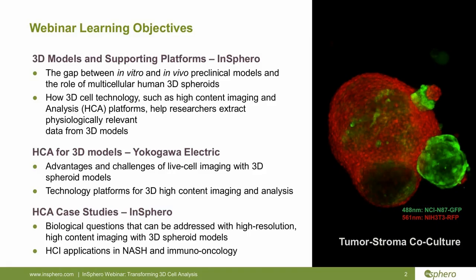So the objectives for today's webinar will include a brief review of how multicellular 3D models can help bridge the translational gap between preclinical and clinical drug development. We'll then discuss how technology platforms like high-content analysis can help researchers extract physiologically relevant data from 3D models.